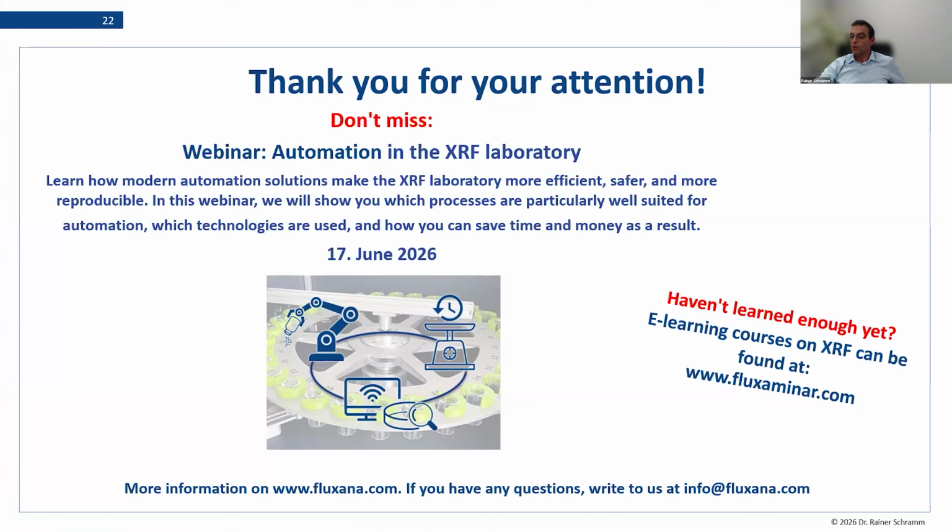So the next question. During calibration in XRF, shall we enter the LOI normalized value or the actual certified value? Yeah, this depends in the end on what state your sample was in when you did the fusion. When you do the sample preparation and fuse your sample, if it is an uncalcined sample, then the LOI happens during the fusion, and then you have, of course, to include the LOI also in your calibration.